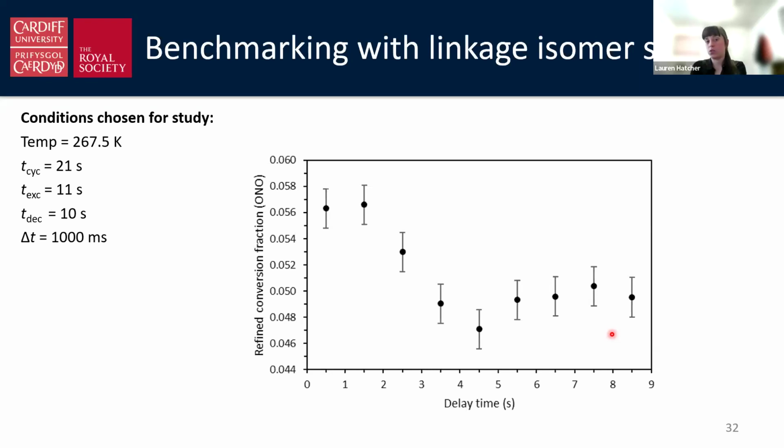So we're talking about 4 or 5%. It's possible that's like the baseline that we're working with, or it's a function of our processing protocols, which seems perhaps more likely. Essentially, we need to think about how we're processing these data. At the moment, we're using just a very standard processing with ShelX and using a disorder model and part instructions just on the data as it is.